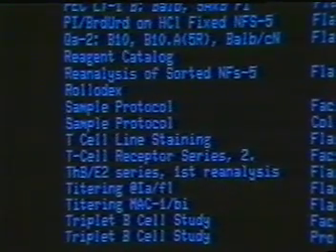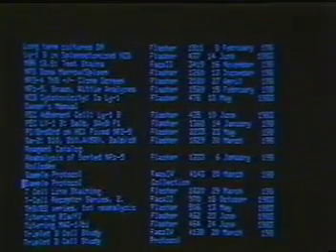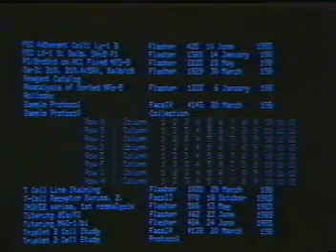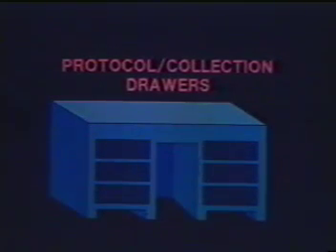After switching into collection mode, the next step is to select and view the collection label for your first sample. With the cursor next to the collection drawer, give the down level command. This sends the cursor to row level. The three levels of a protocol collection drawer are the same in both modes. However, the command structure is different.